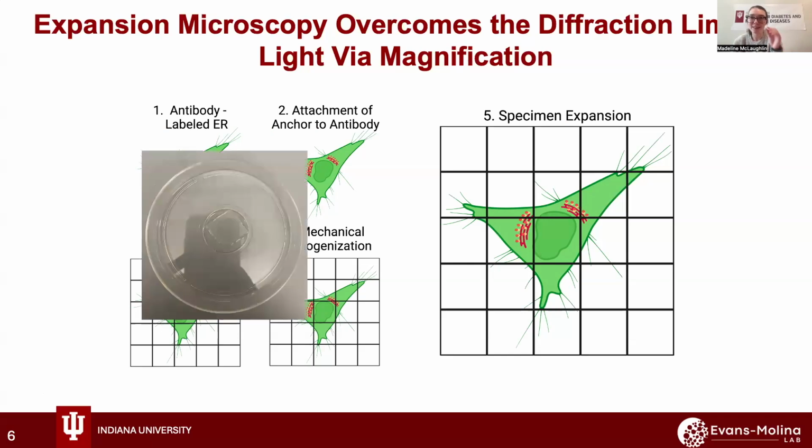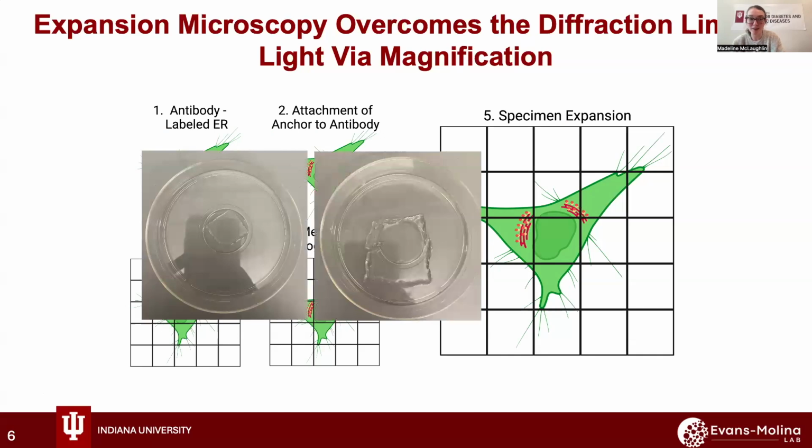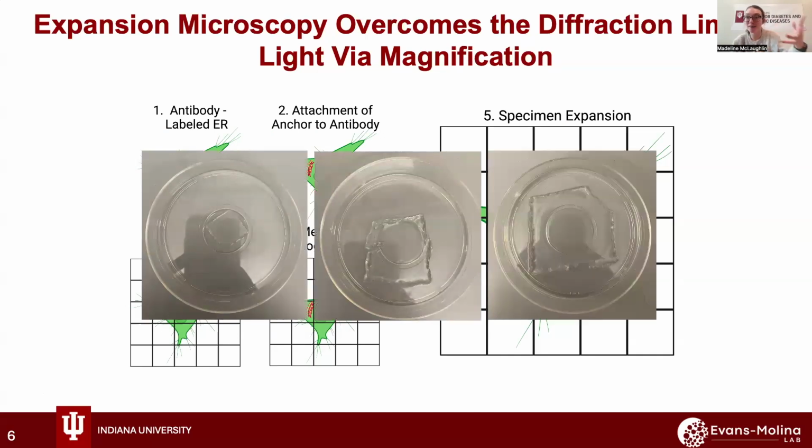So here is an example of one of the gels I made. Here's the initial gel size. You add some water, it grows, you add some more water, and it expands even further. This technique simply separates single molecules that would otherwise be too close together to resolve.